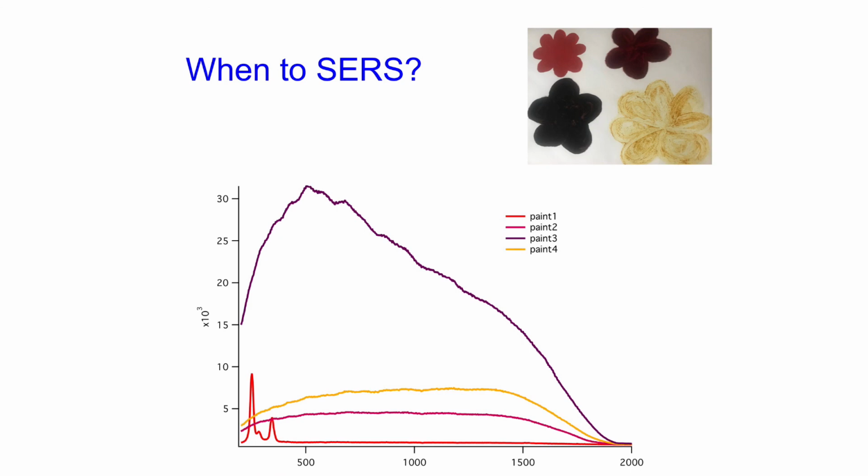Those broad peaks are due to fluorescence that has been excited in your molecule. Some molecules are going to generate a fluorescence response and some are not. And so your job is going to be to think about which ones are likely to generate a response. That's going to be helpful in aiding your identification of your dyes and pigments.